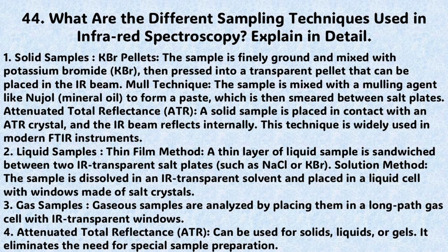Liquid samples. Thin film method: a thin layer of liquid sample is sandwiched between two infrared transparent salt plates such as NaCl or KBr. Solution method: the sample is dissolved in an infrared transparent solvent and placed in a liquid cell with windows made of salt crystals.